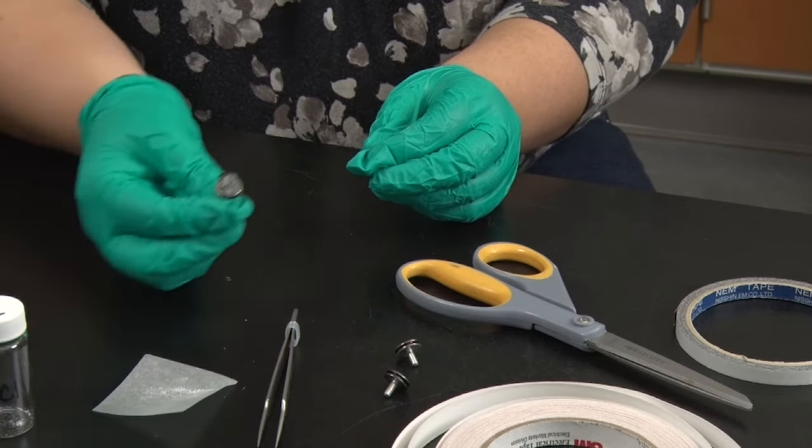The metal that we will deposit is actually held in the lid, and this small circular disc just next to the sample is called a quartz crystal microbalance. It can measure how much material has been deposited. After loading the sample into the chamber and closing the lid, I can evacuate the chamber using a vacuum pump. Once the chamber has been evacuated, I can start the deposition.